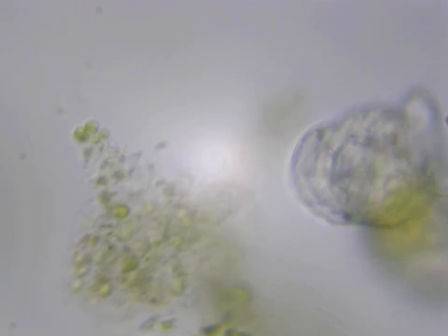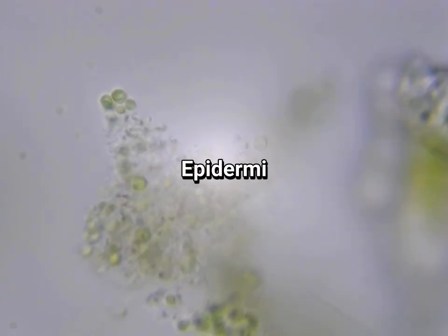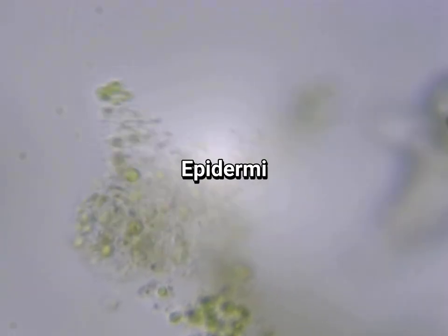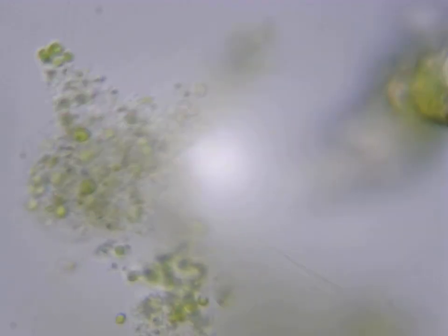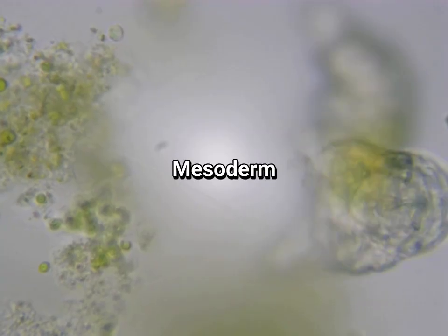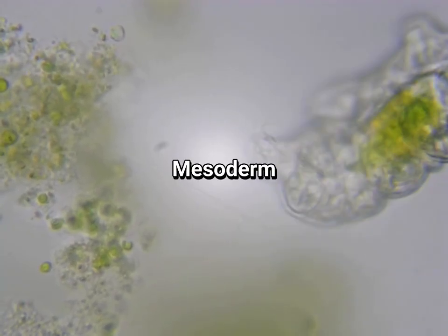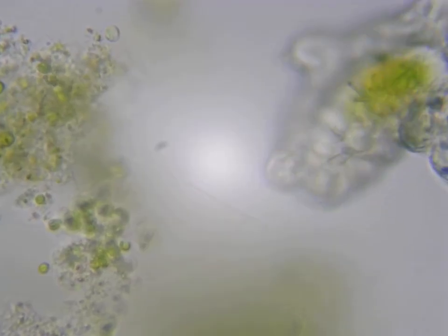Their bodies have three main layers. First is the epidermis, or outer layer, which provides protection and contains specialized cells that produce the protective tun during cryptobiosis. The middle layer, known as the mesoderm, contains muscles and circulatory elements.